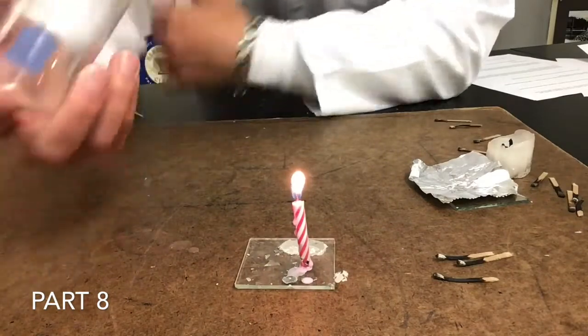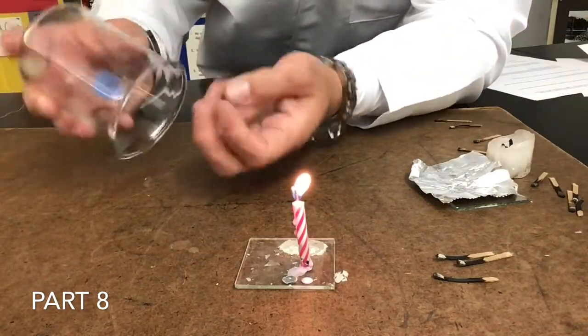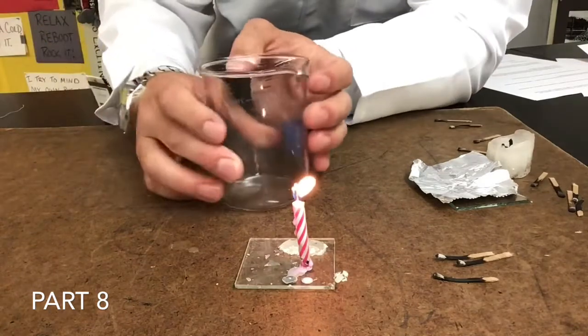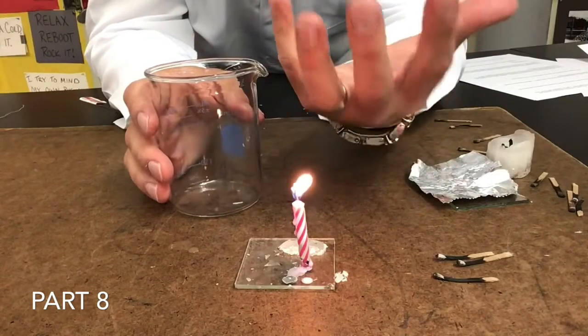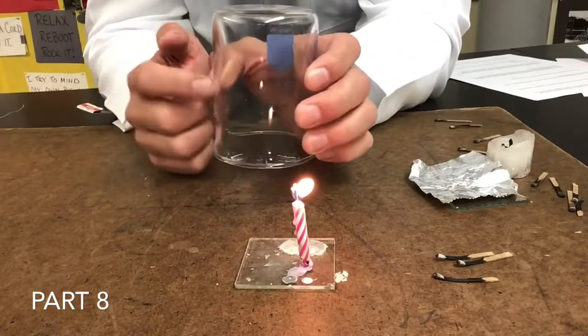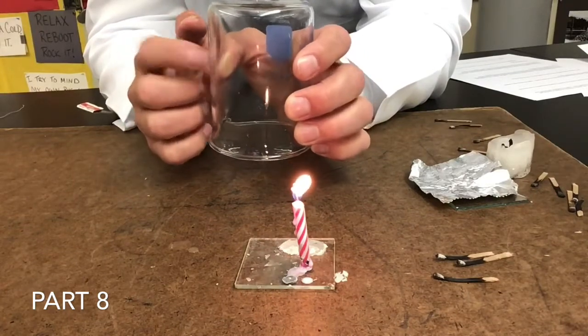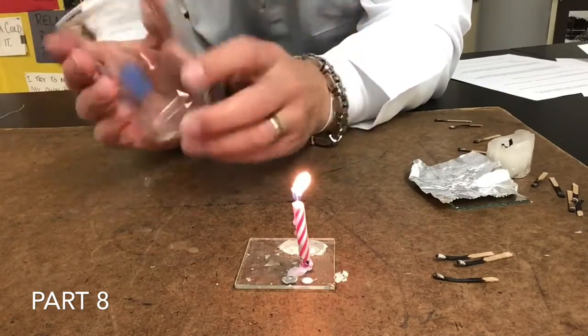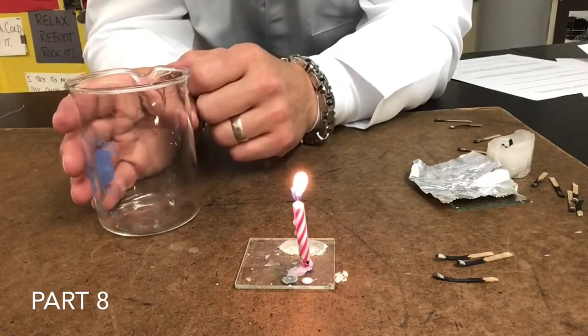So let's see. If I look inside here, let me feel. It's wet. It actually is water. So interestingly enough, when a candle is burning, that flame is giving off gas that is water, H2O. And when you hold it upside down and that gaseous water, that water vapor, hits a cold beaker, it turns back to liquid. So interesting, the water that was vapor condensed back on the beaker, all right?